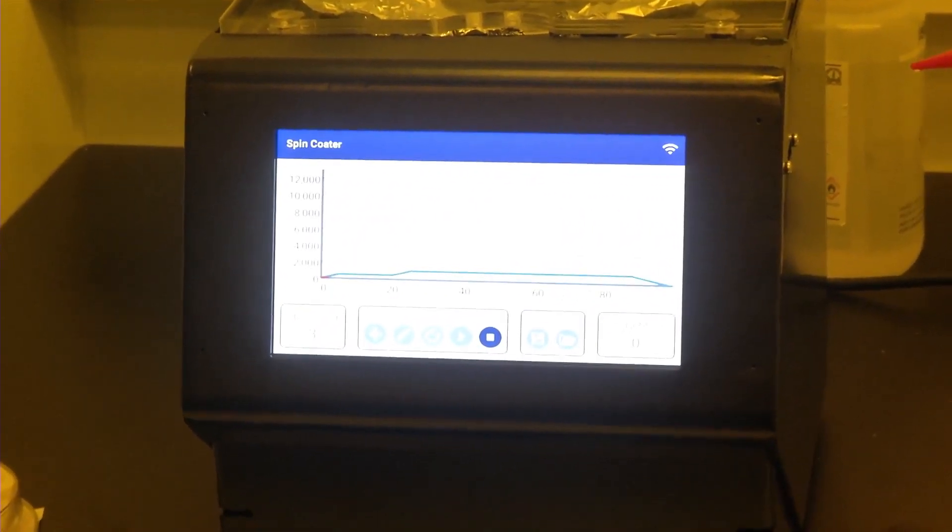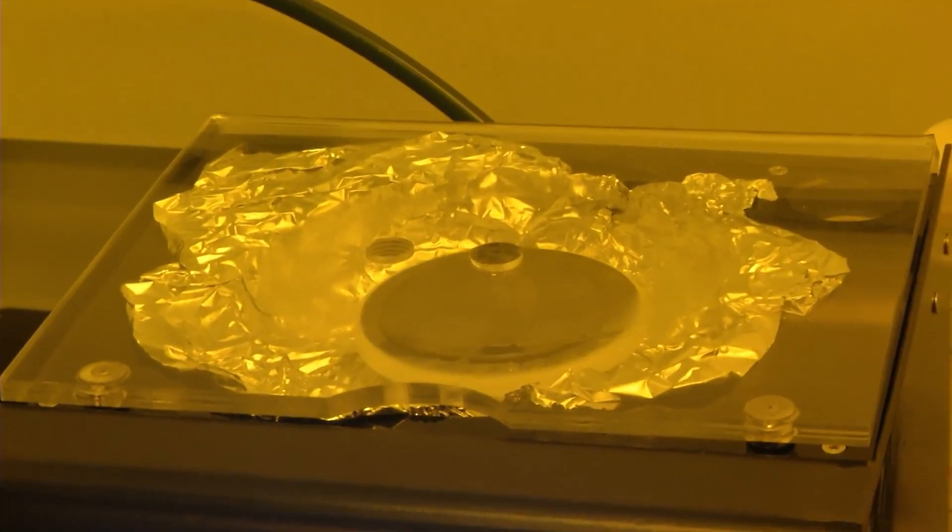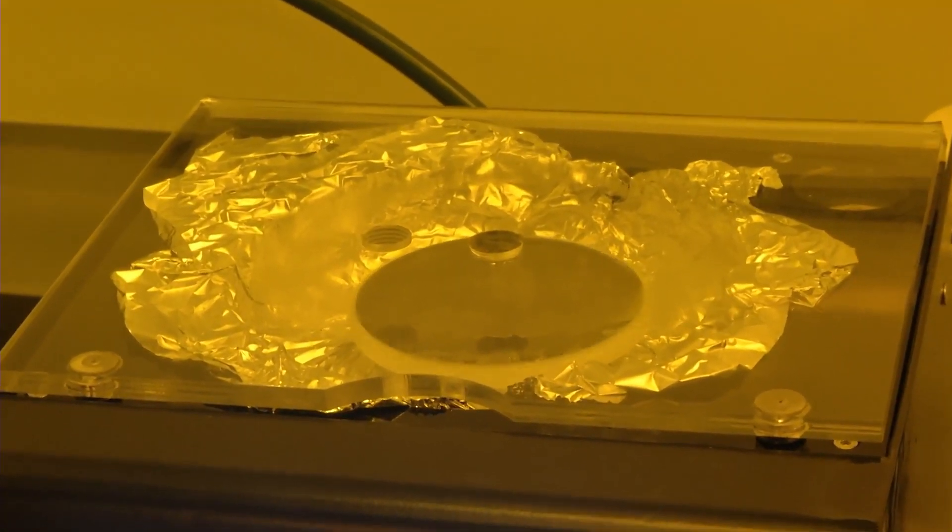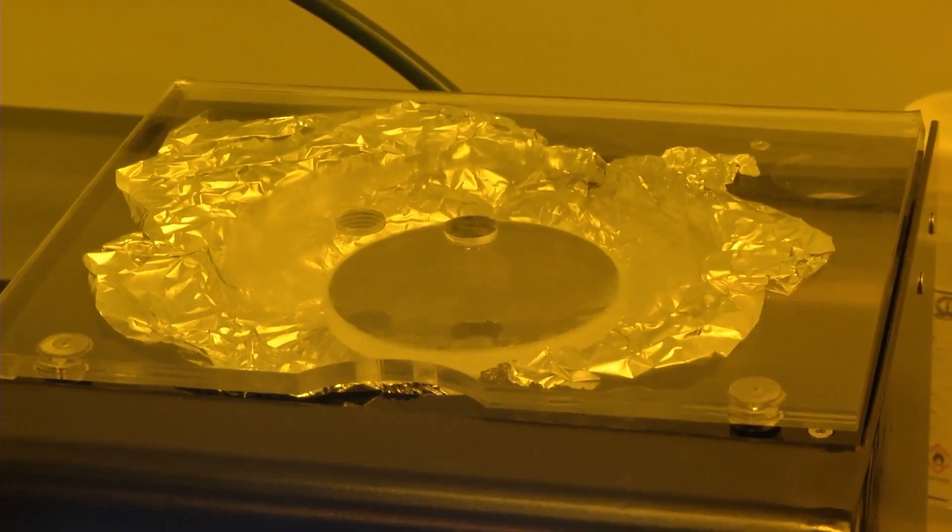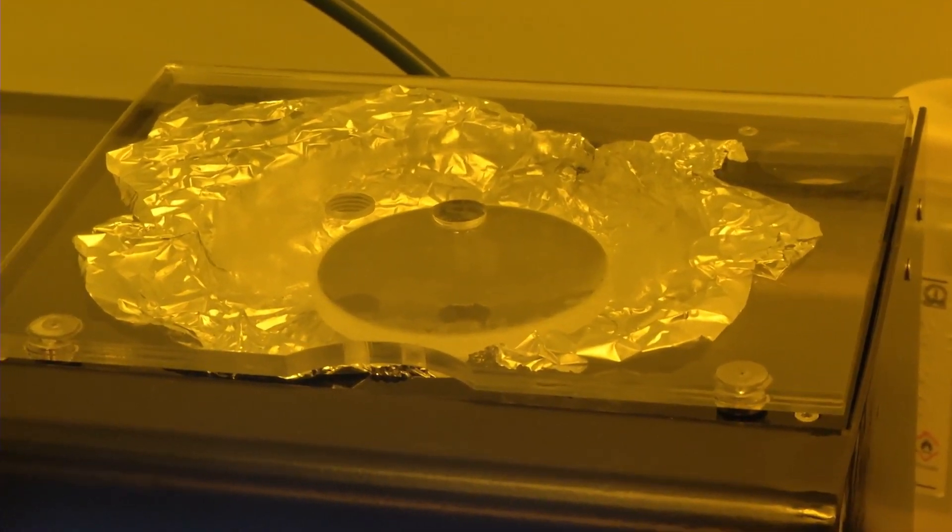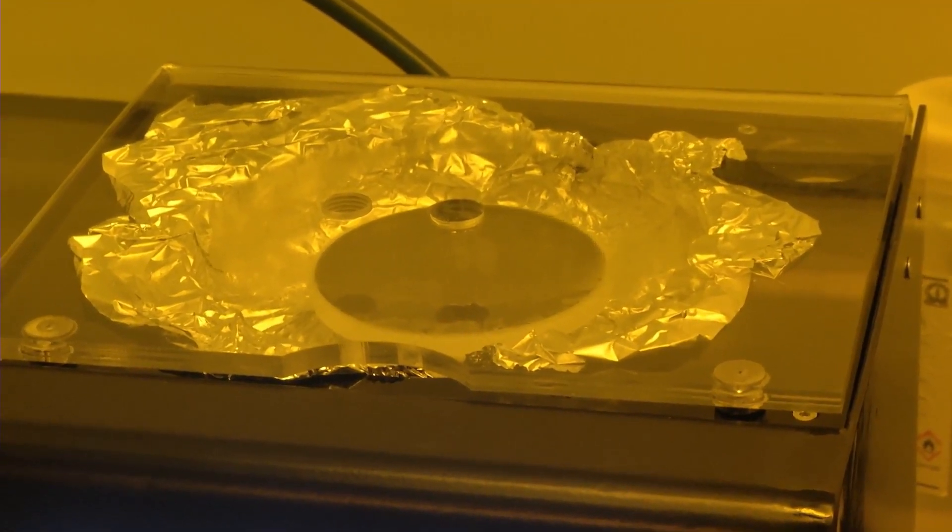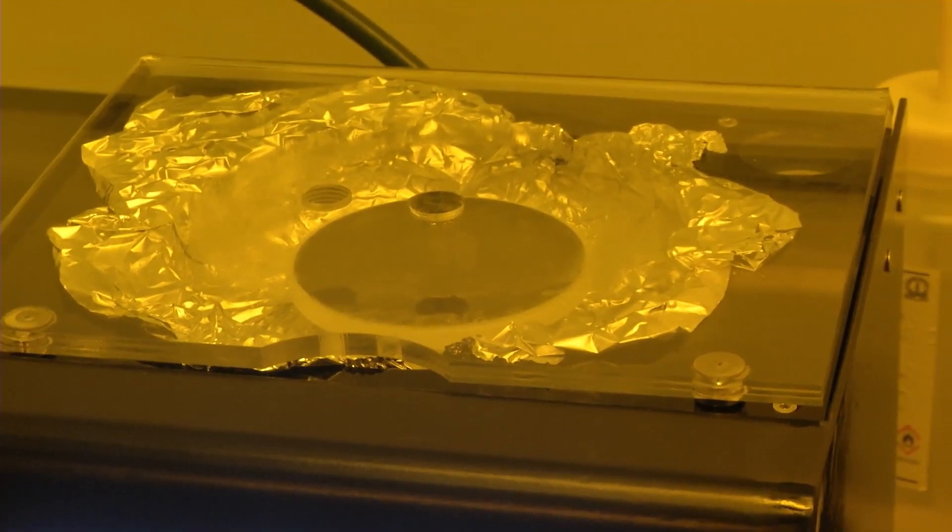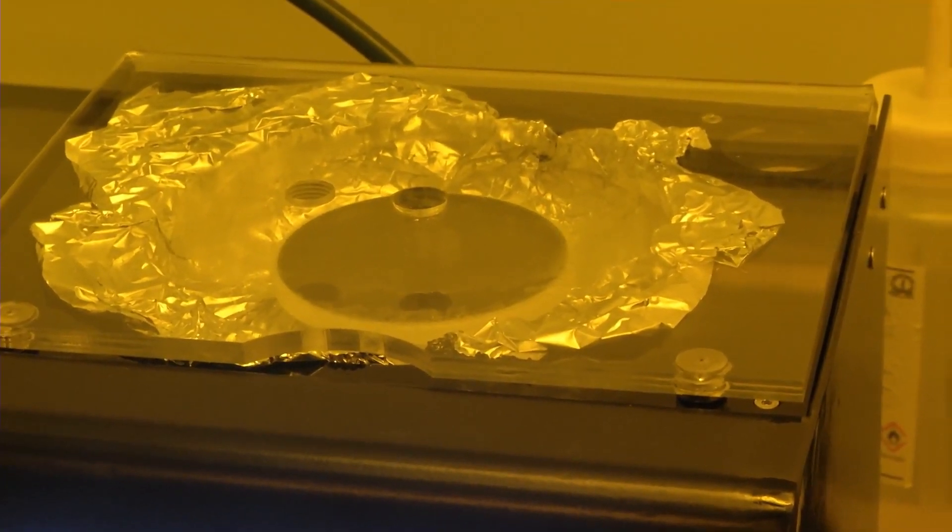The spin coating process has started and the wafer has started rotating. This is the first step where the polymer precursor is spreading. Once this step is over, the next step will increase by ramping up to the speed where it can thin down while also evaporating some of the solvent.